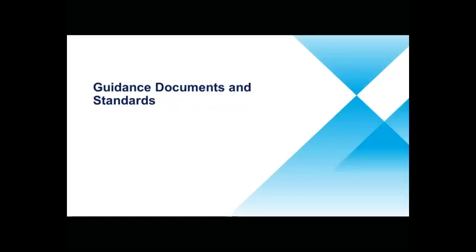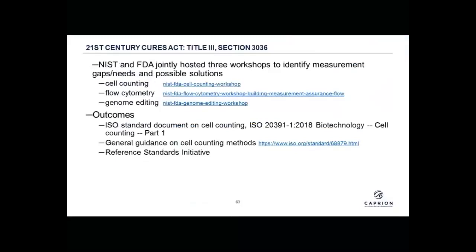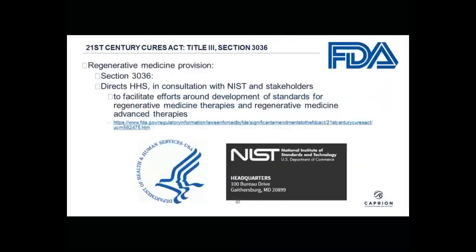So let's talk a little bit now about guidance documents and standards. So I'm going to start with this slide. Can I do that? Yes. So NIST and the FDA last year hosted 3 workshops on cell counting, flow cytometry, and genome editing. And I actually attended one of these workshops, and the reason they had them was because of this 21st Century Cures Act, which I was unaware existed until I attended the workshop.